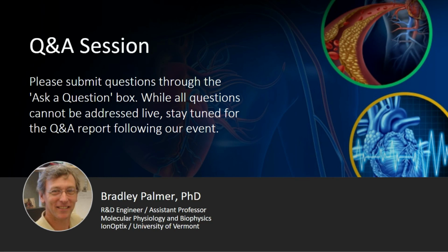Okay, great. The next question is wondering if you've ever tested this in atrium slices. No, but that sounds like a great idea. Along with the right ventricle, I think as you develop experience with your vibratome, you'll be able to learn a way to make slices from these other parts of the heart, whether it be RV or atrium. There's no reason why it couldn't happen. It's just, I'm sure, a little bit more challenging than the LV. Yeah. Okay, great.